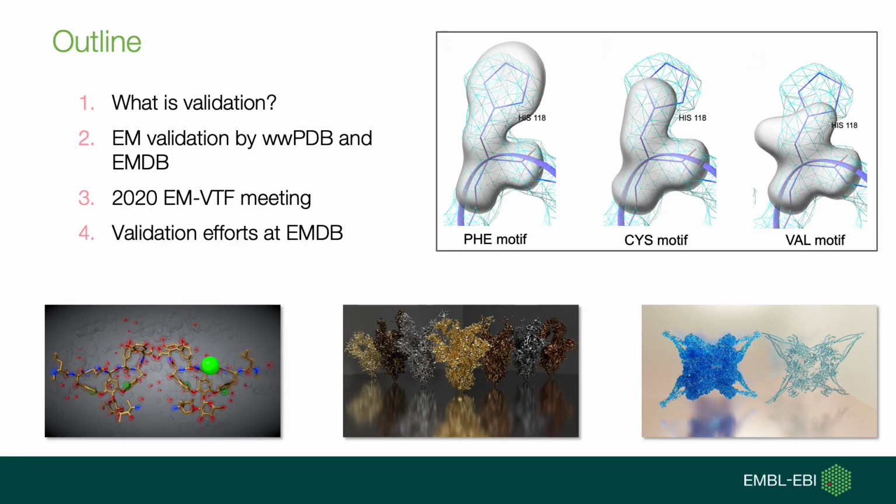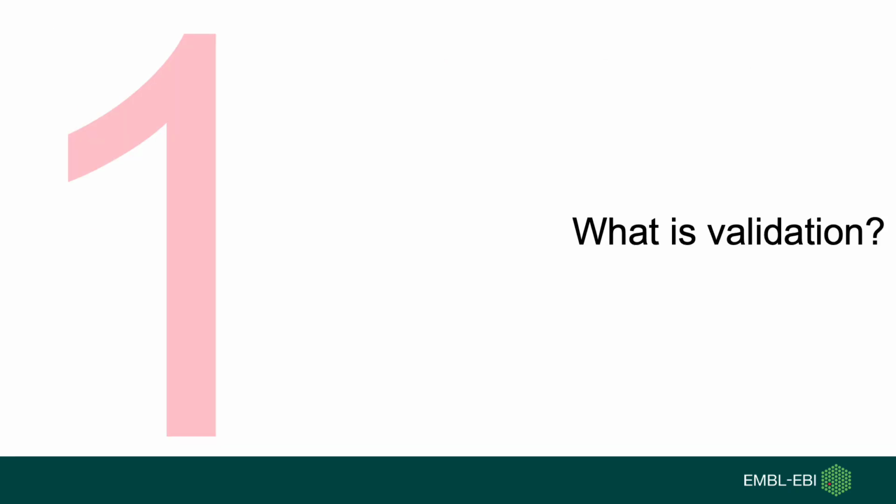So first, a few slides about what we have learned about validation from crystallography mainly. Then what wwPDB and EMDB have been doing over the years in the area of EM validation. Then some of the recommendations from a meeting we had in early 2020 of the validation task force. And finally, some of the work we're doing at EMDB, partly implementing the recommendations, and also some other work that I'll discuss.